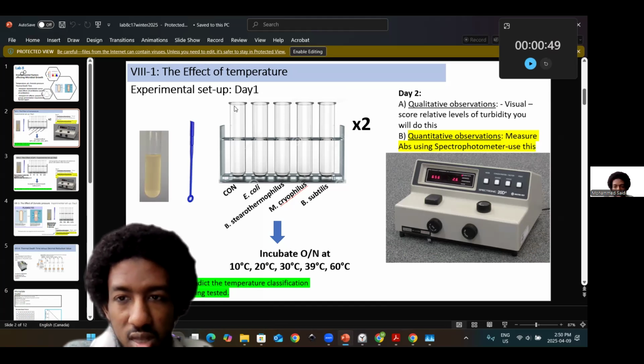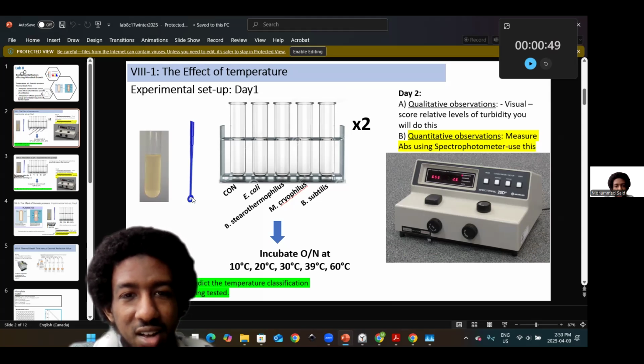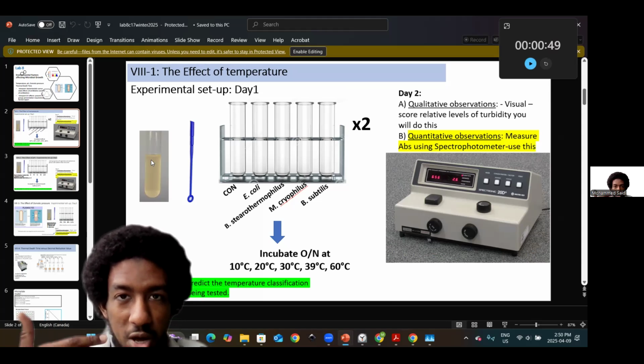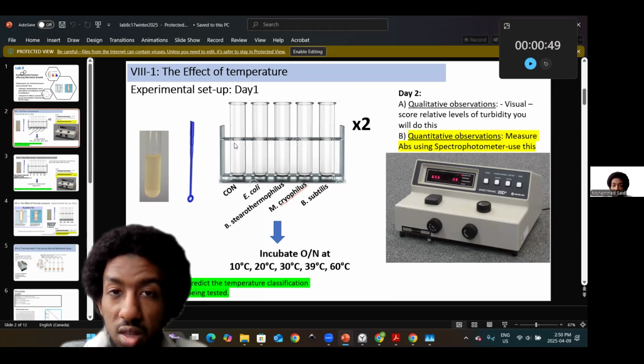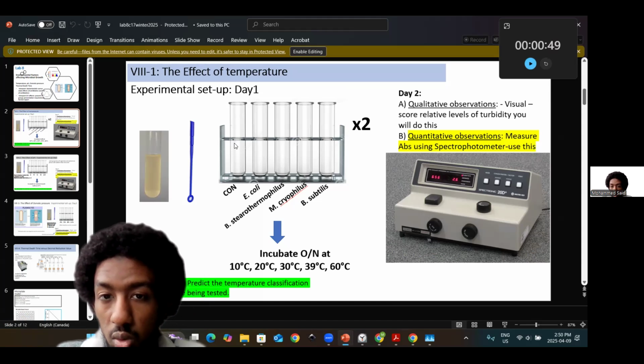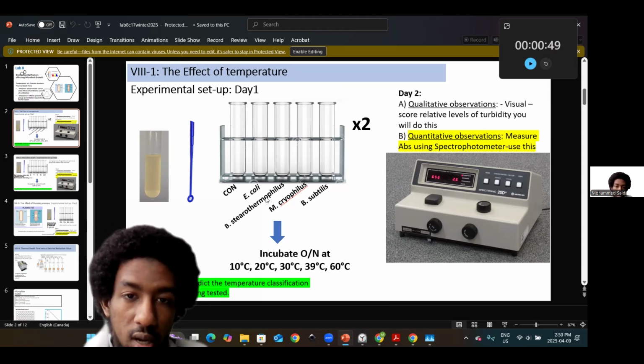Right. So let's go forward, right? So you have your inoculation of one full 10 microliter end of your loop, and then following resuspension. Remember resuspension, right? Think about limitations as I described them to you, right? Because there's certain things that you can already know based on what we've talked about, based on what you've recorded, based on what you can elucidate, in prep for your lab exam.